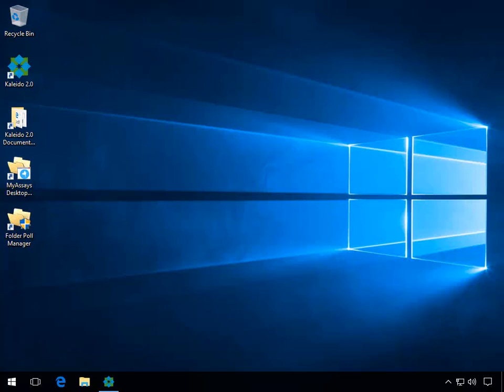In this series of videos, I will show how you can use folder poll to automatically perform data analysis with MyAssays Desktop when measurements are completed with the Kaleido software. In this first video, I will show how you can configure a Kaleido measurement protocol to export the data ready for MyAssays Desktop Pro, and show how to create a MyAssays Desktop protocol that can import this data automatically each time those measurements are performed using folder poll. In this way, you can create a seamless workflow between measurements and data analysis results.